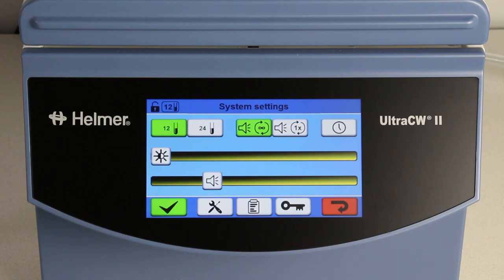Here, you can select the rotor type and adjust settings such as display brightness and sound level.